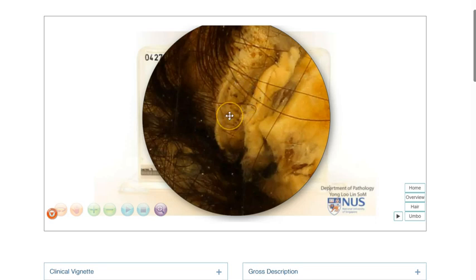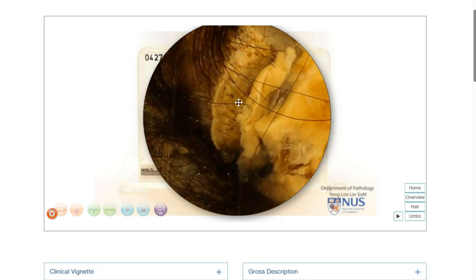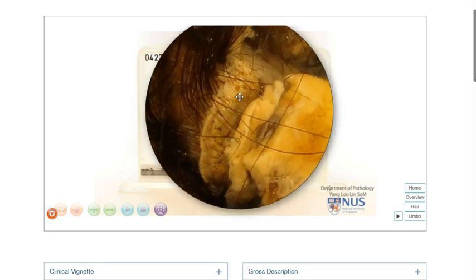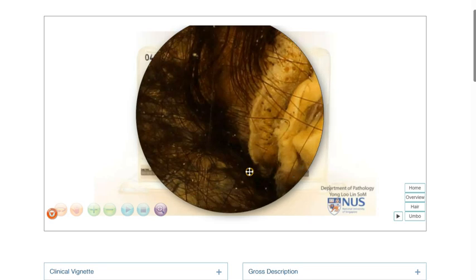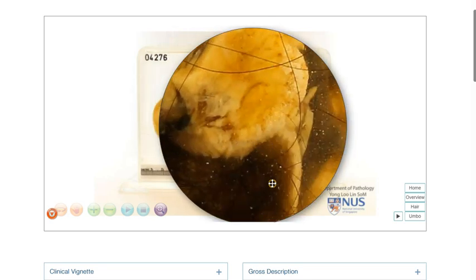On microscopy, this would actually show skin structures, including keratinizing stratified squamous epithelium with underlying adnexal structures. And this explains why we can see hair that is coming out of this skin.